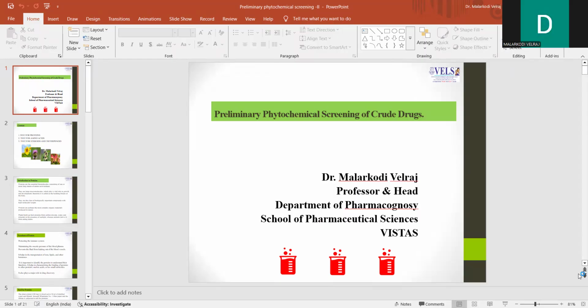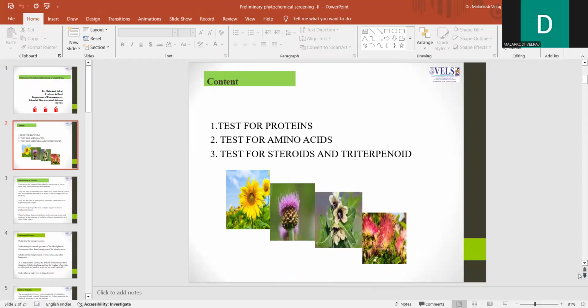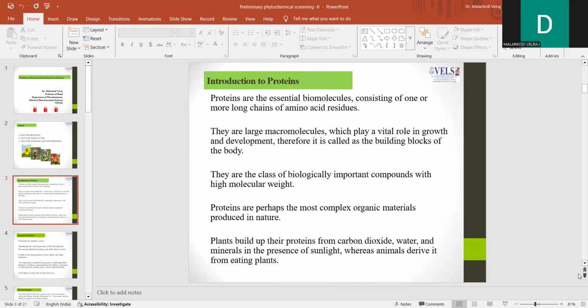I'm Dr. Malarkodi, Professor and Head, Department of Pharmacognosy, School of Pharmaceutical Sciences. I'm going to discuss the phytochemical screening of crude drugs for proteins, amino acids, steroids, and triterpenoids.